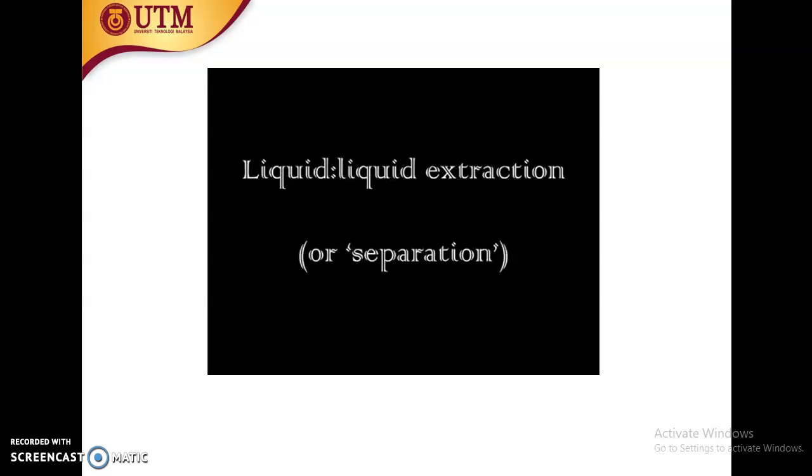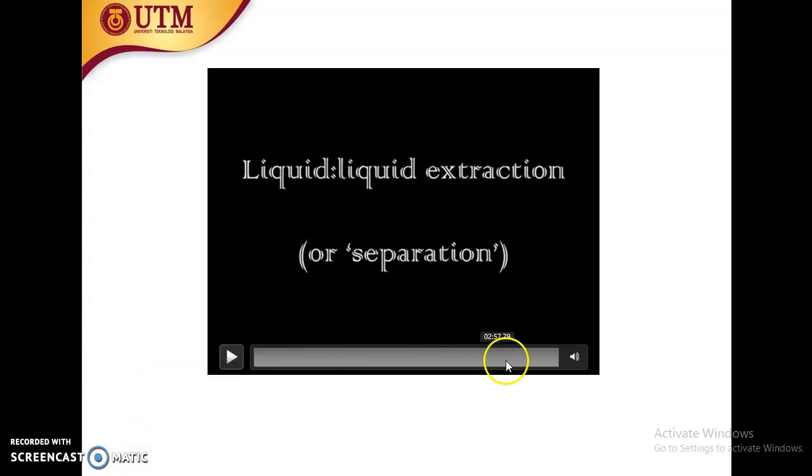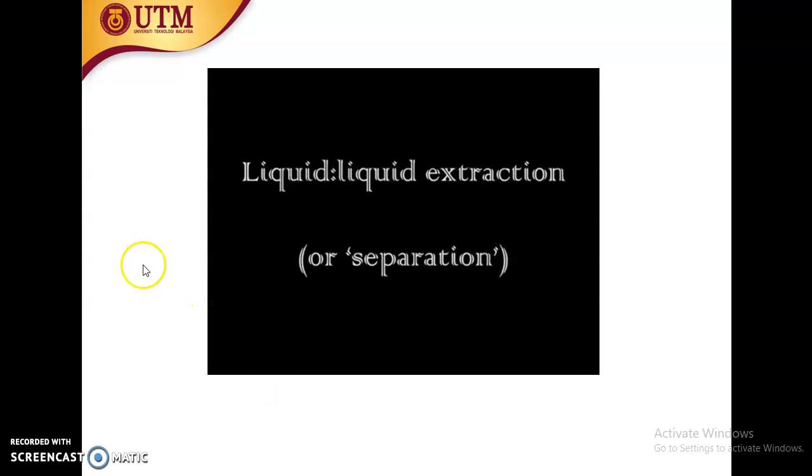Okay, this is the conventional liquid extraction. Let us see first. How many minutes is this? 3 minutes, only 3 minutes.